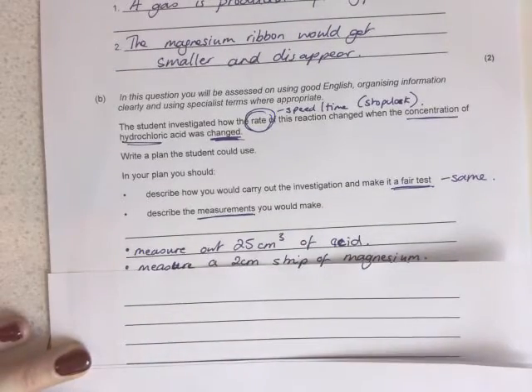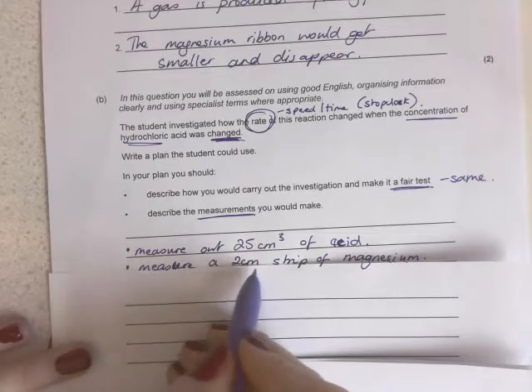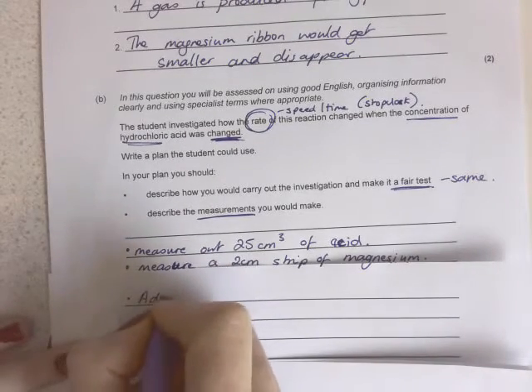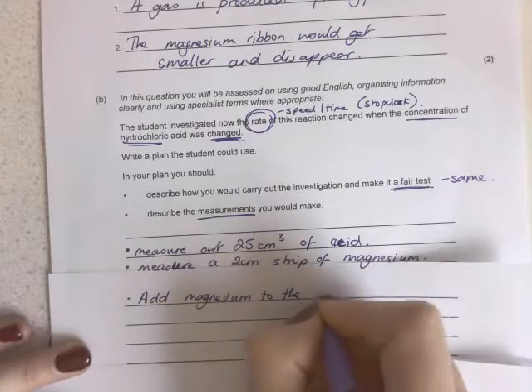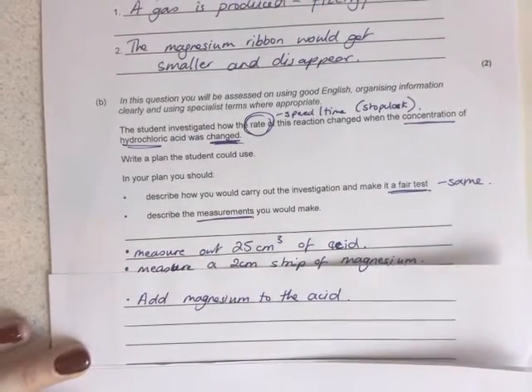So I've measured a 2 centimetre strip of magnesium. Again, I've said that it's going to be the same. Add the magnesium to the acid. Now remember, it's to do with speed, so I need to use my stop clock.